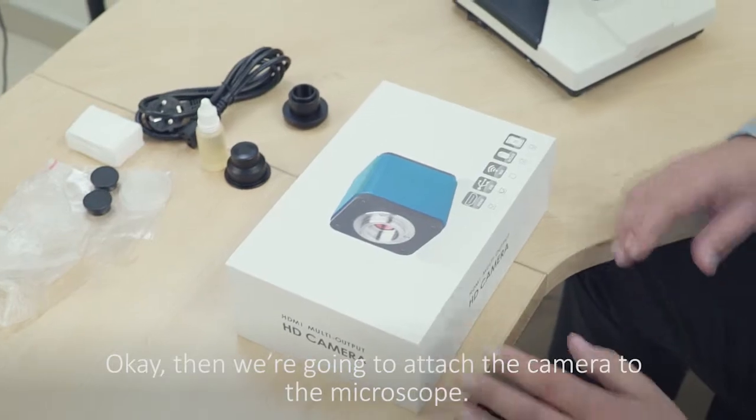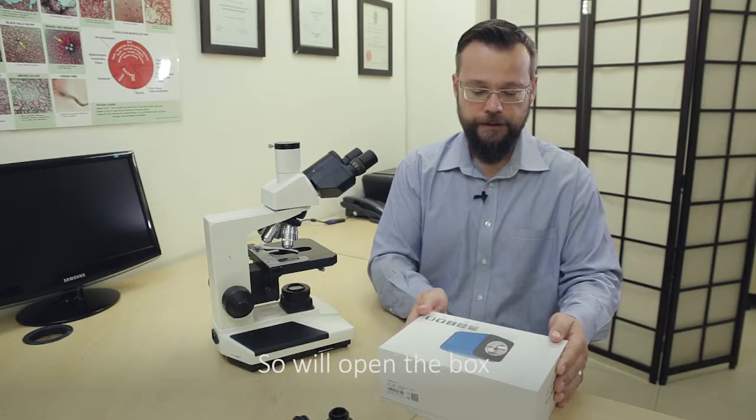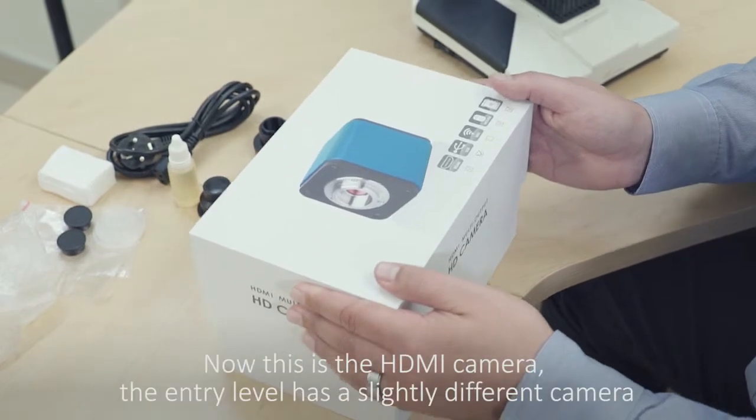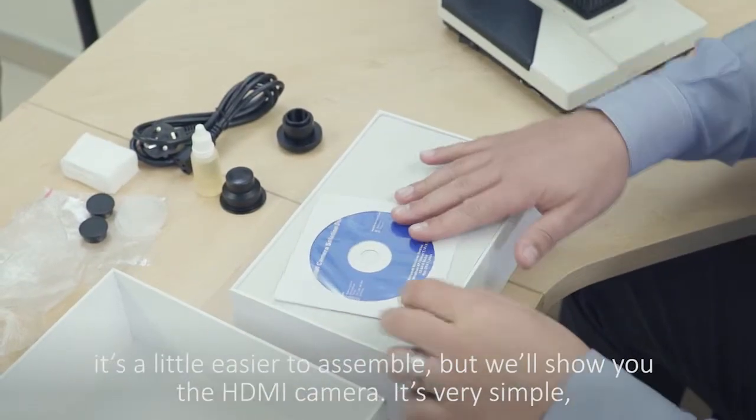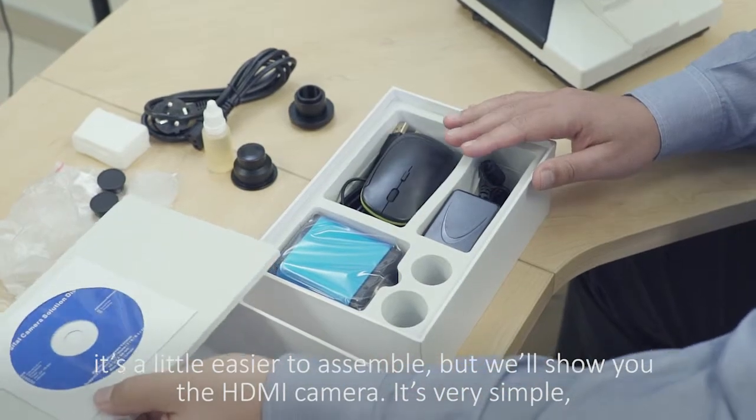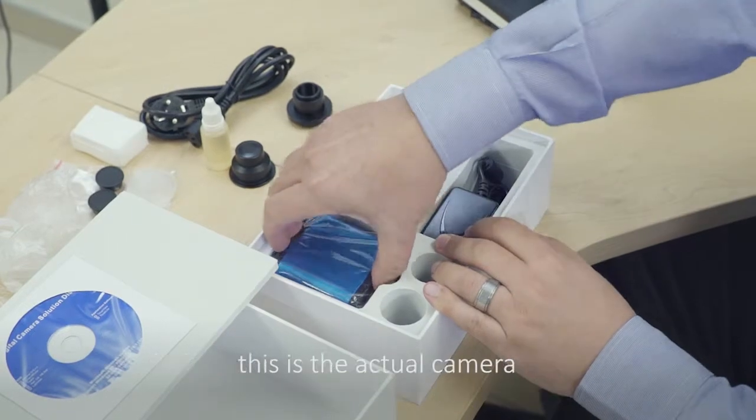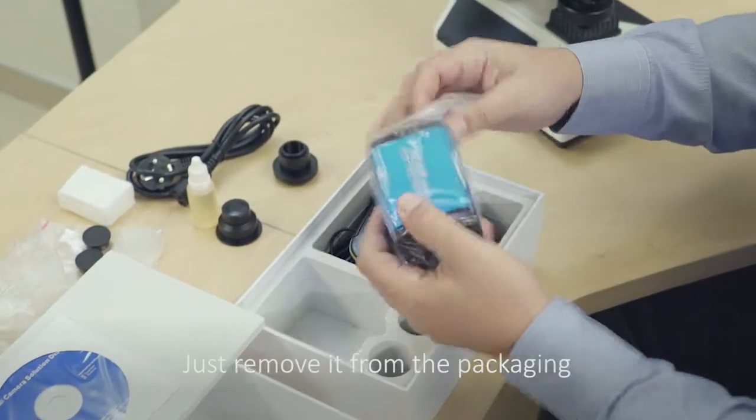Okay, then we're going to attach the camera to the microscope. So we will open the box. Now this is the HDMI camera. The entry level has a slightly different camera, it's a little easier to assemble, but we'll show you the HDMI camera. Very, very simple. This is the actual camera. Let's remove it from the packaging.